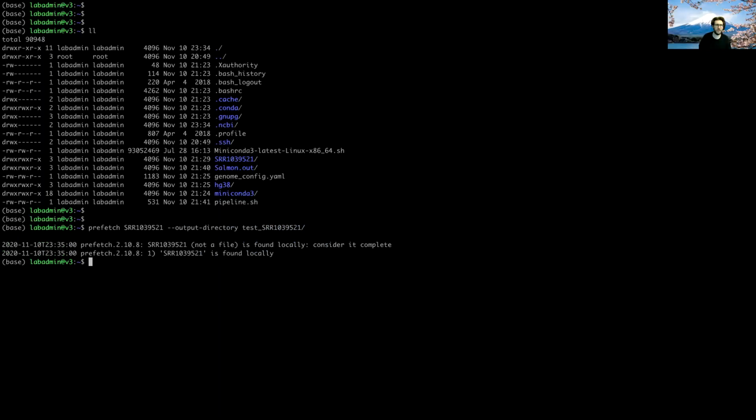Yeah, so I think you have to delete the other folder. Which one? The SRR? Yeah, the SRR one. Or we can try another SRA number maybe, just as a demonstration. If you delete that SRR folder, it'll work. Okay, remove the SRR.